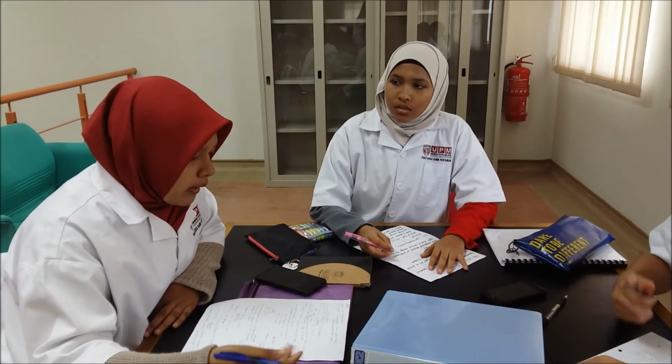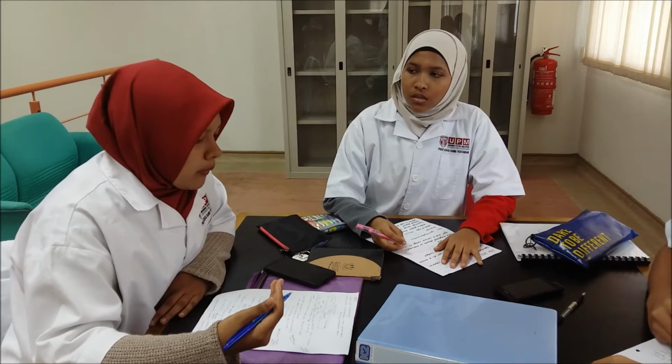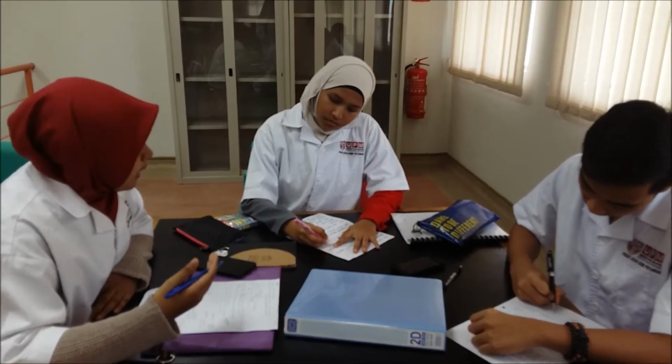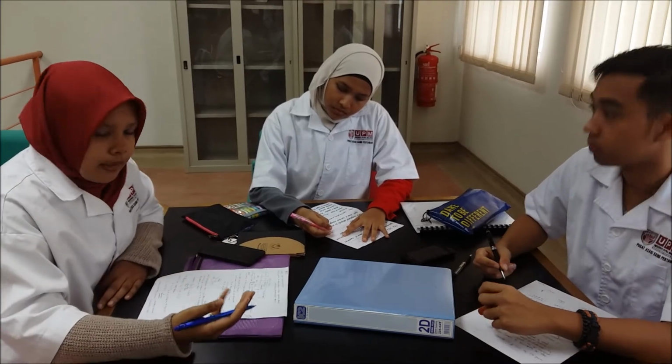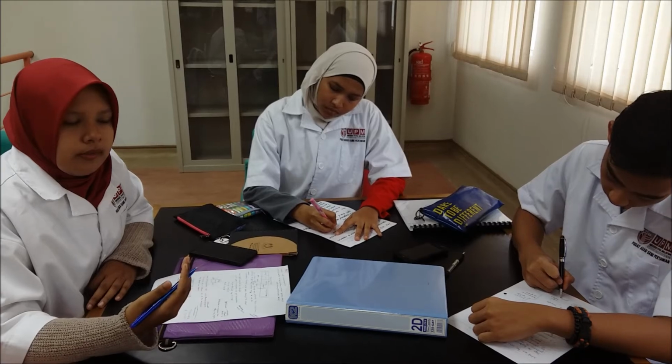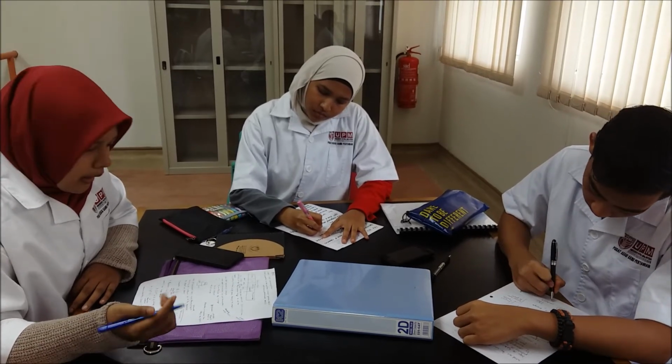Okay. So, the spectrophotometer is also used in physics. In physics, light is an electromagnetic wave. It exhibits properties such as wave nature, the visible spectrum effect, and particularly the photoelectric effect. In physics, there are formulas to calculate the transmittance.